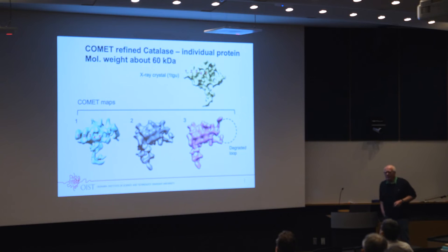But tomography, where you don't average, naturally, it doesn't matter. You see what you see in there. So we pushed all this better and better as we went. And this is an example of catalase when I really started to doubt myself.